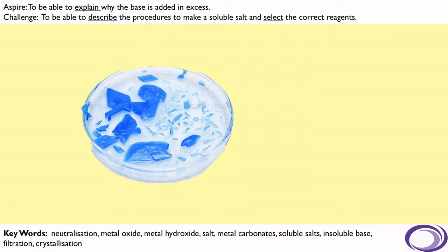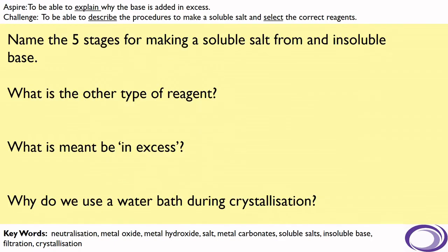The crystals you would be left behind with at the end of this should be pure copper sulfate crystals. Now what I'd like you to do is answer the questions on the screen. Feel free to pause the video to give yourself plenty of time to answer them.